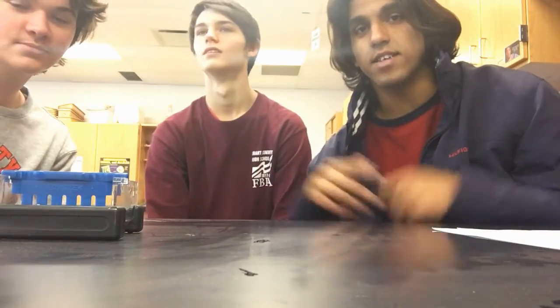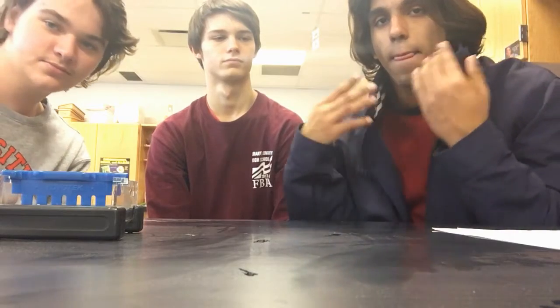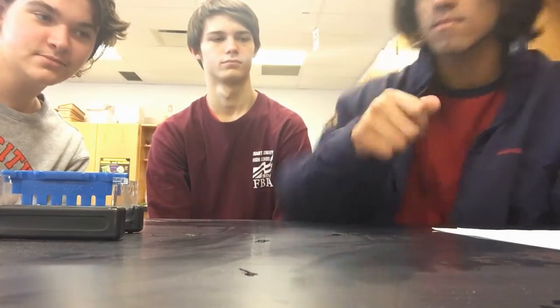Hello, today we are making a restriction enzyme digest. So, let's get this bread. What are we about to do right now? The agarose. Alright, so we will be pouring the agarose right now. Gotta put this together first. He's getting the mold on so it doesn't leak out.